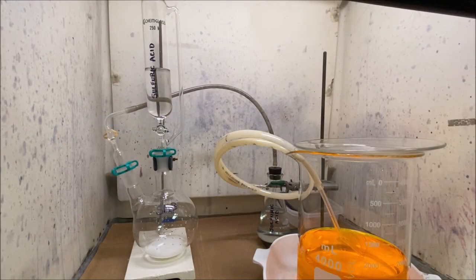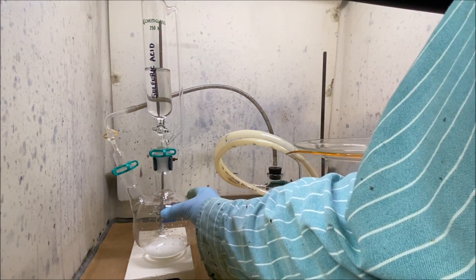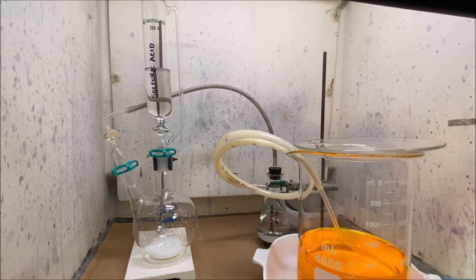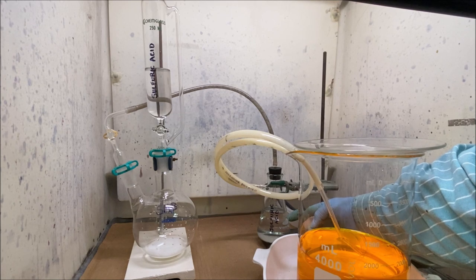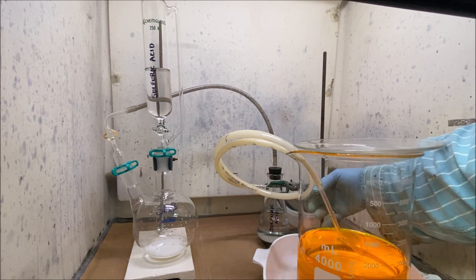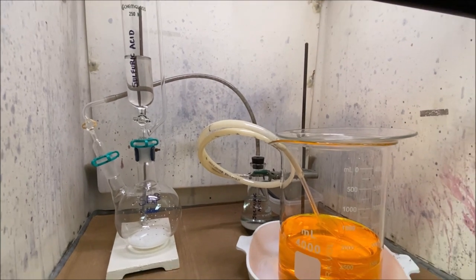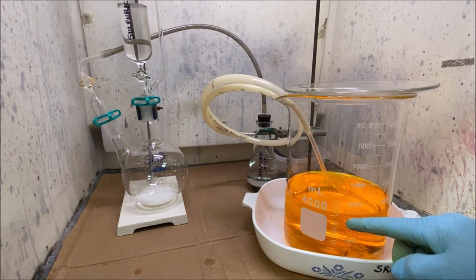Here we go. I've got my SO2 gas generator set up. I've got some SMB in here as a slurry, and sulfuric acid up here in the addition funnel. I've got a line that comes out and goes back to a flask that has some sulfuric acid in it to cool and clean the SO2 gas that comes out of the gas generator. The clean gas will bubble through this tube, and we're going to pass it into our gold solution here and precipitate out the pure gold with SO2 gas.